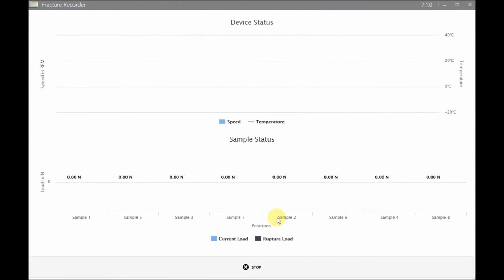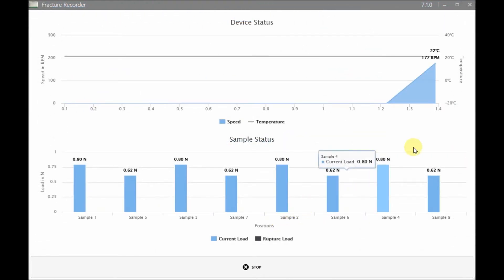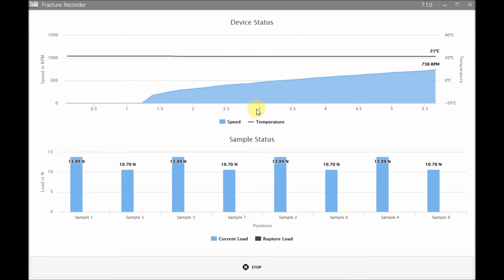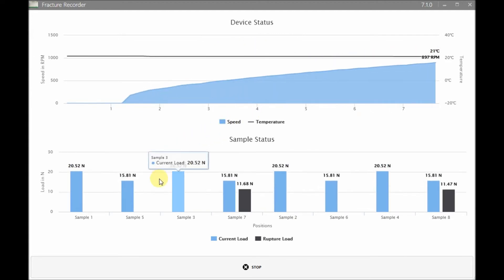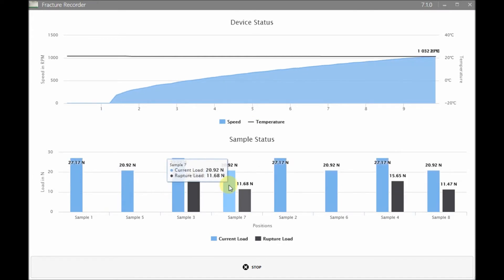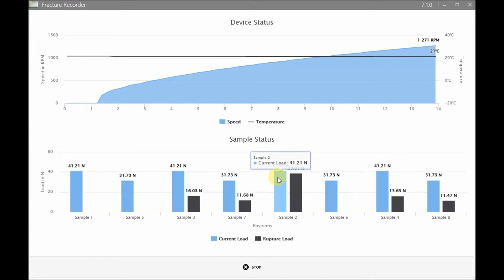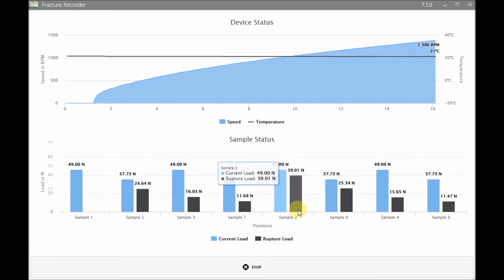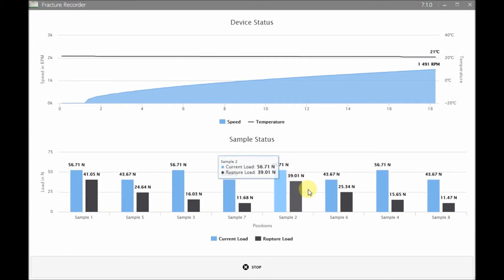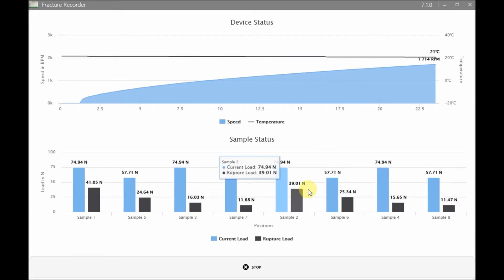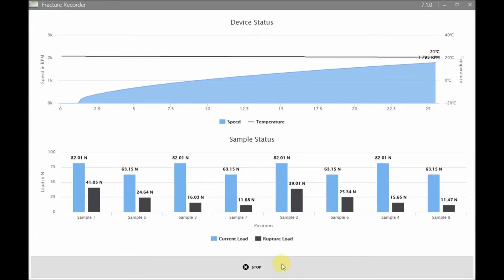During the measurement, speed and temperature are displayed in real-time in the device status graph in the upper part of the recorder window. The current applied loads for each sample are shown in the lower chart as vertical blue bars. When a sample detaches, a grey bar next to the blue bar shows the rupture or breaking force for the corresponding sample. See now how the breaking force is displayed for all of our samples. Now we can stop the measurement.